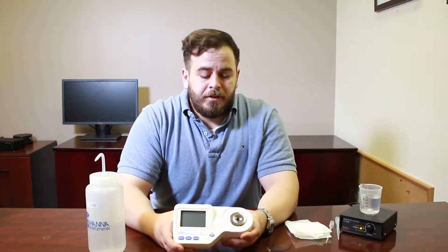The HI-96822 is designed just for artificial or natural seawater, and it's a really great little device to use — partially because it has something called automatic temperature compensation. When you are measuring salinity via refractive index, it uses a light source, bending that light source, and based on the amount of dissolved particles in the water, it gives you a value of specific gravity, practical salinity units, or parts per thousand.